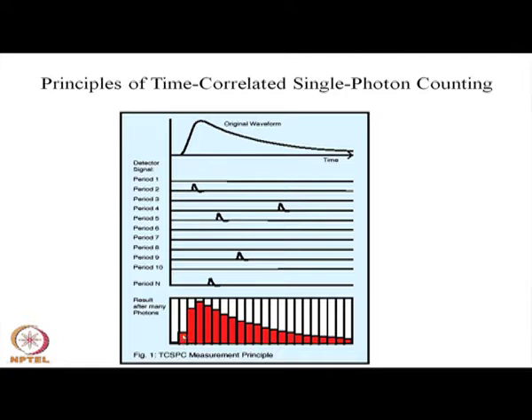This is maybe delta t, some lower value, then another value. So, you see that this data has been piled one after another, so that it gives you the idea that at this time gap most of the events are occurring, and at this time gap very few events are occurring. That means maybe this corresponds to 100 pulses, this corresponds to 10 pulses or maybe 50 pulses, and this way you generate the histogram.